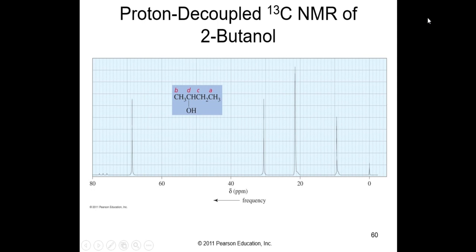Here's a proton decoupled C-13 spectrum of 2-butanol. Now we're looking at carbon signals. This is proton decoupled. In other words, we're simply starting by getting the different number of carbons, the different environments. So we have community A, B, C, and D. A is a primary carbon, B is a primary carbon but it's next to D which is the secondary carbon with a C-OH. Then you have community C which is a secondary carbon. So we're going to get four signals, and here's your TMS.